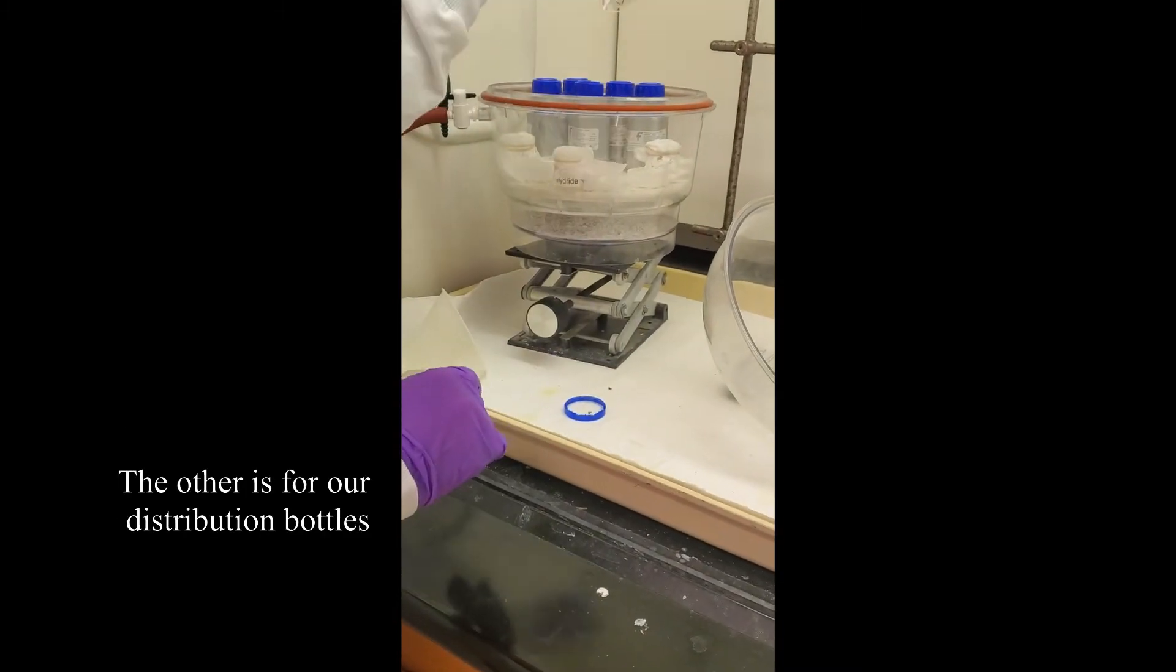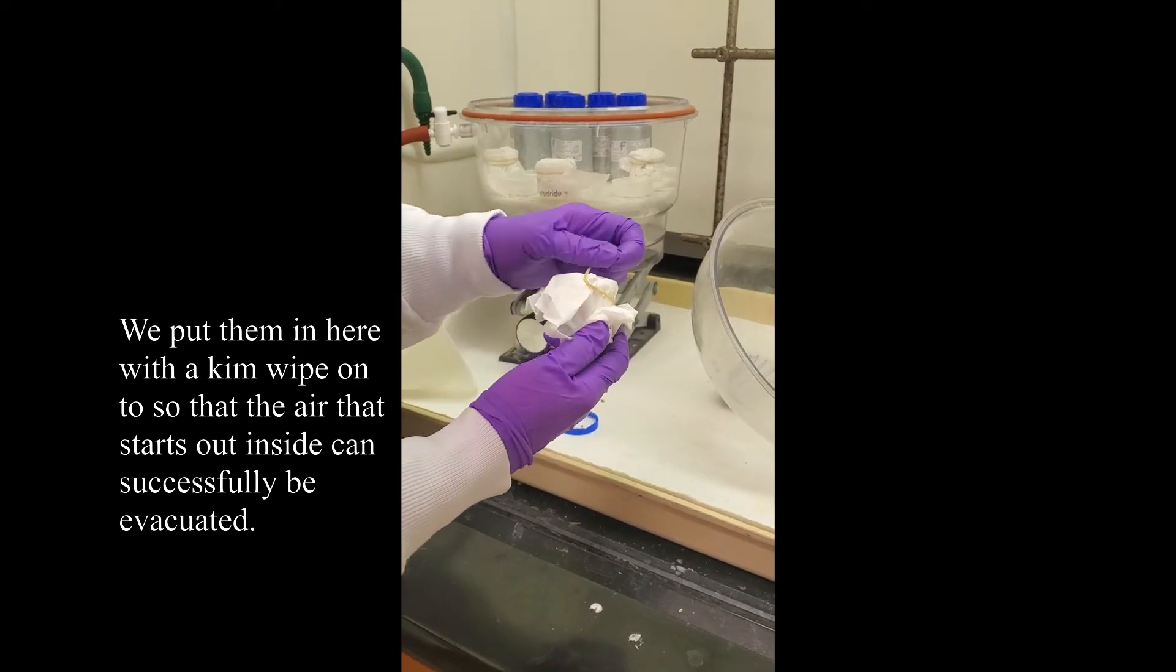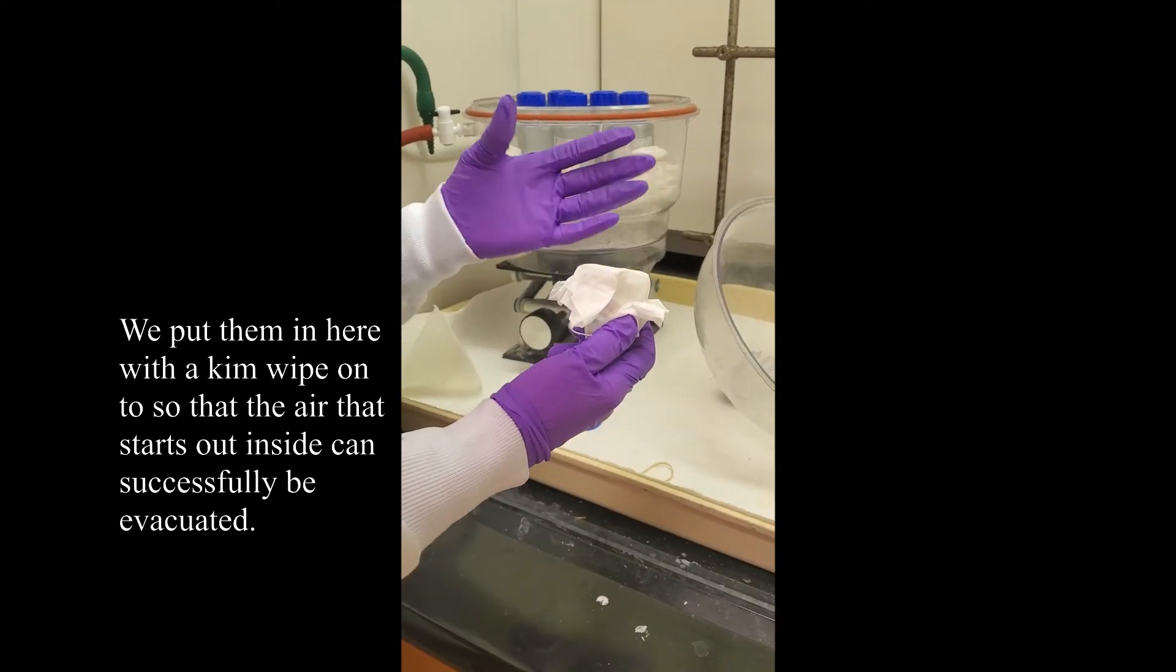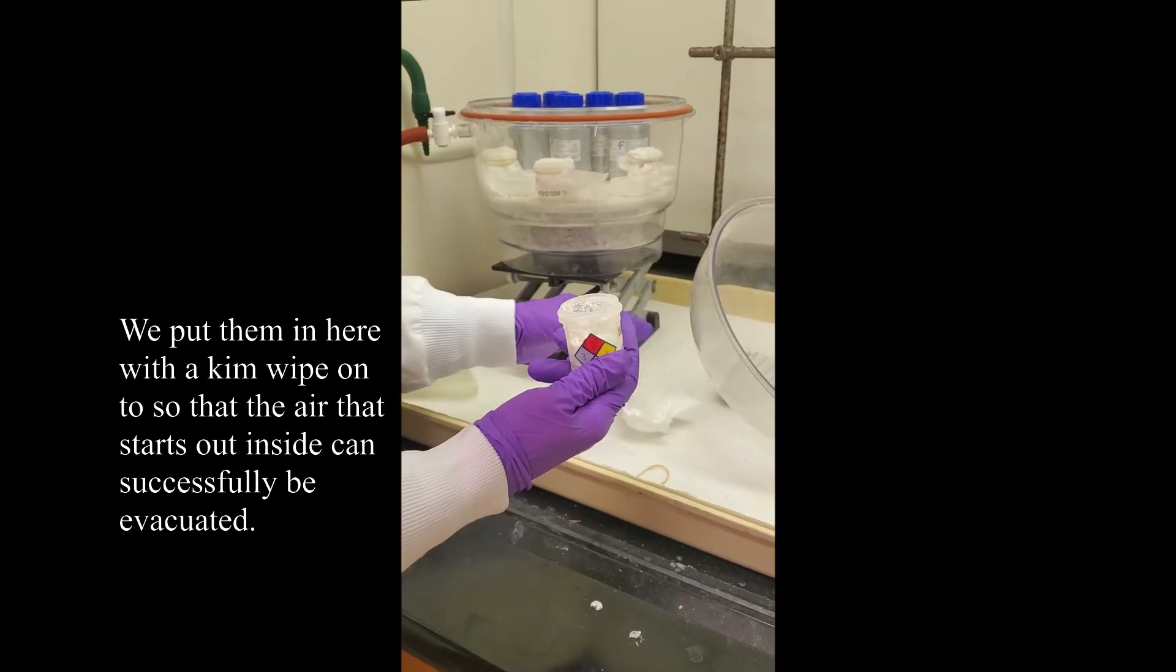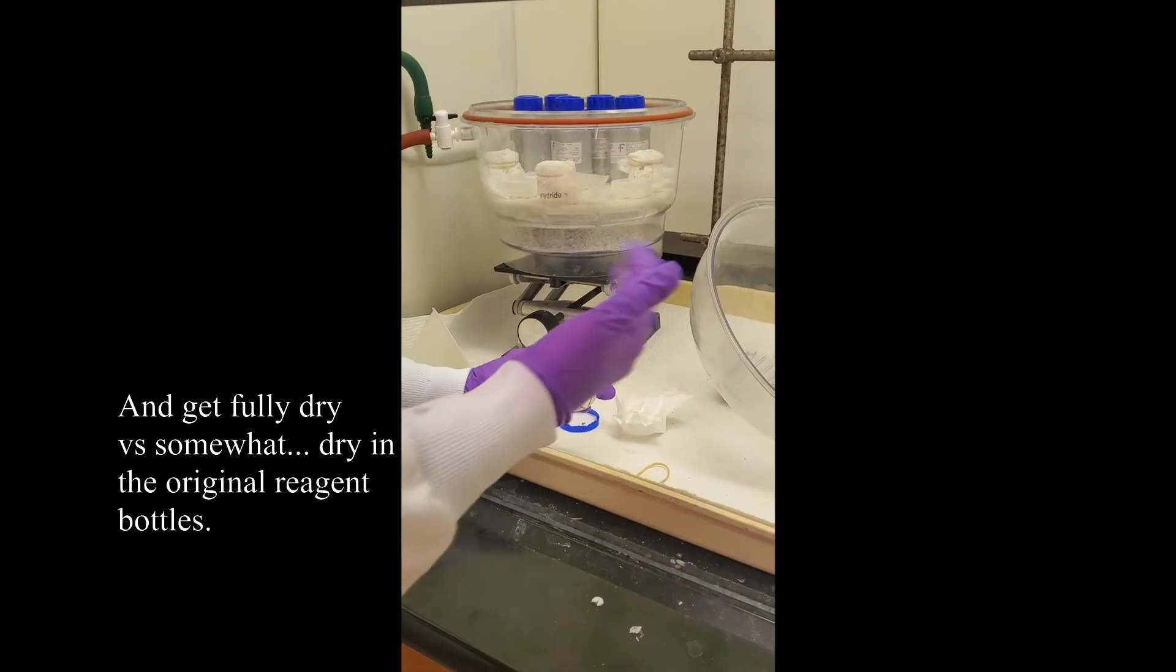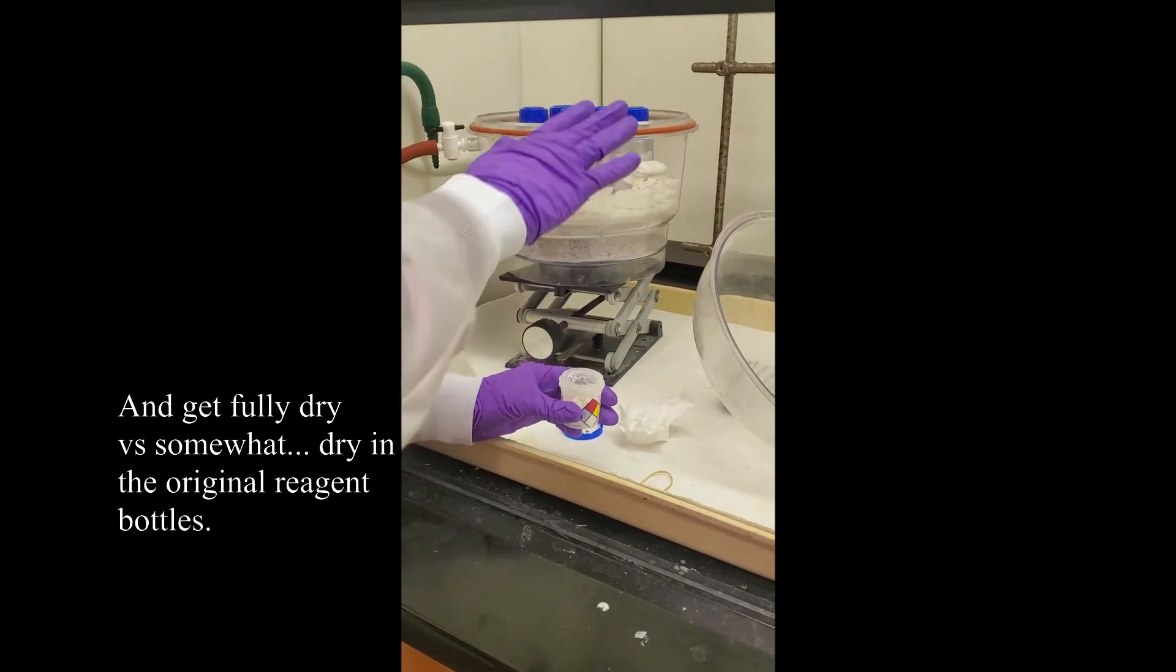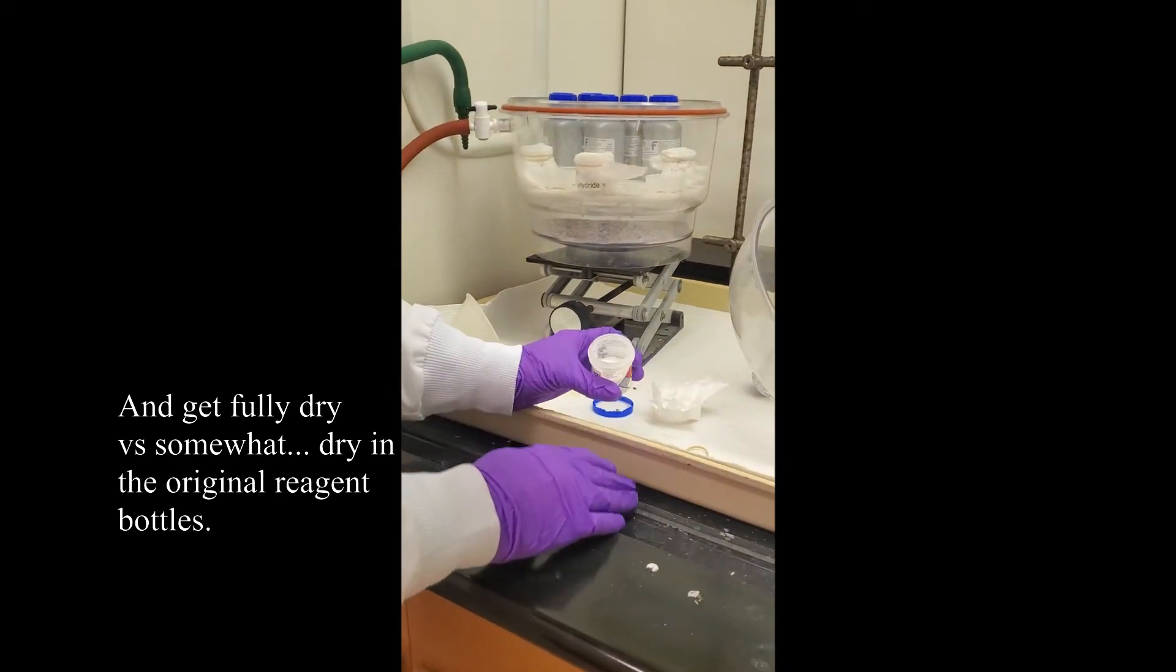The other is for our distribution bottles. We put them in here with the Kim Wipe on top so that the air that starts out inside can successfully be evacuated and get fully dry versus somewhat perhaps dry in the original reagent bottles.